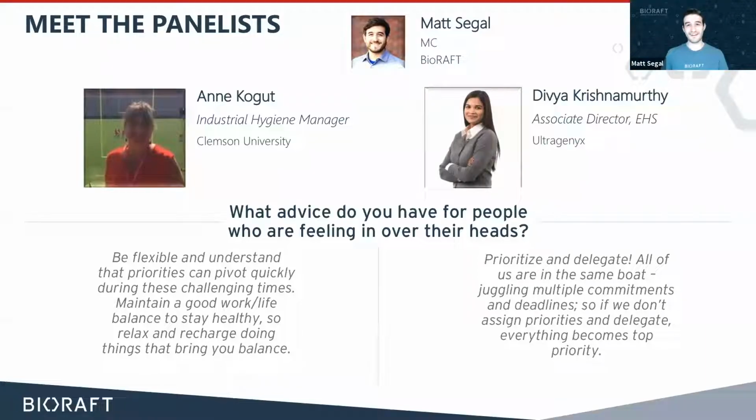Yeah, and I see you nodding your head there. Yeah, I totally agree. During this time, people were really concerned about COVID, but they also wanted to get back to work, so the only way was really to delegate it back to the labs. They took on more responsibility than they had in the past, with labeling their chemicals, keeping track of them, entering that information, and answering our requests.